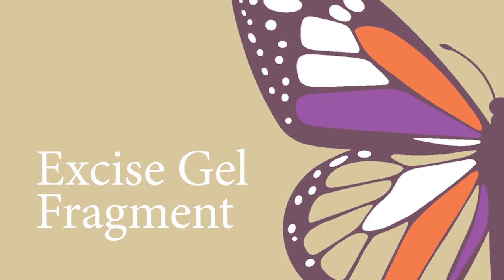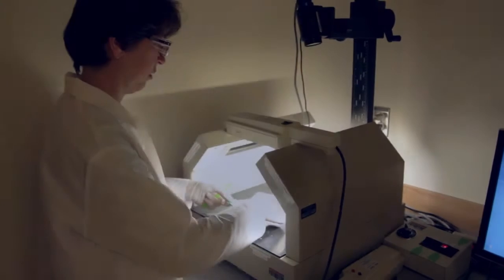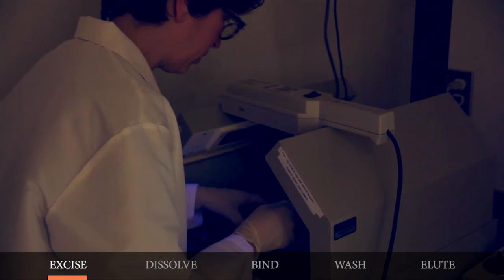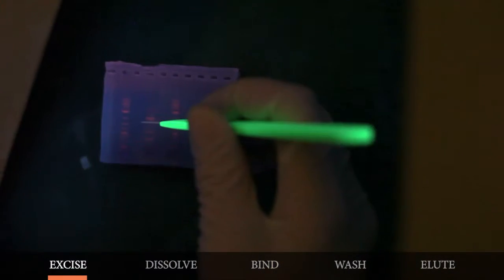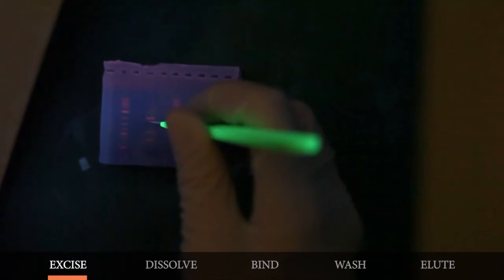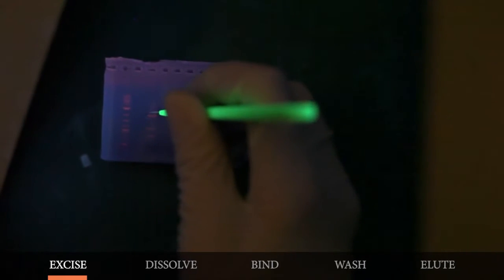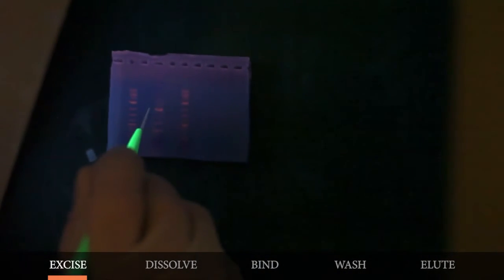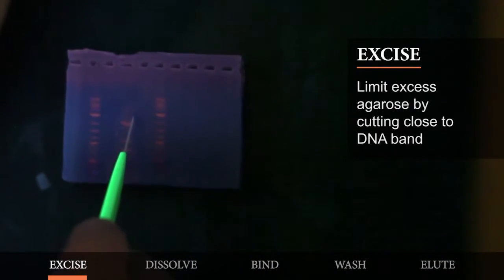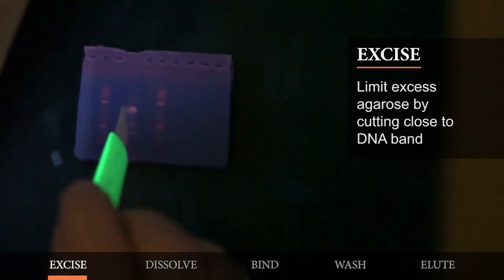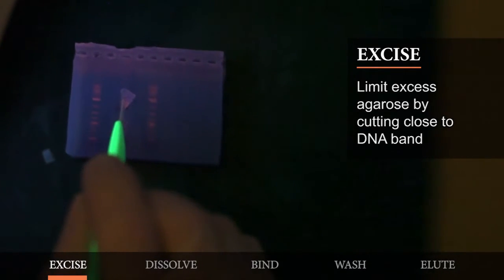The first step of the protocol is to excise the gel fragment. Visualize the DNA fragment of interest under UV light and excise it from the gel using a razor blade, scalpel, or other tool. Try to cut the agarose as close to the DNA fragment as possible to avoid excising excess agarose and limit UV exposure as much as possible.